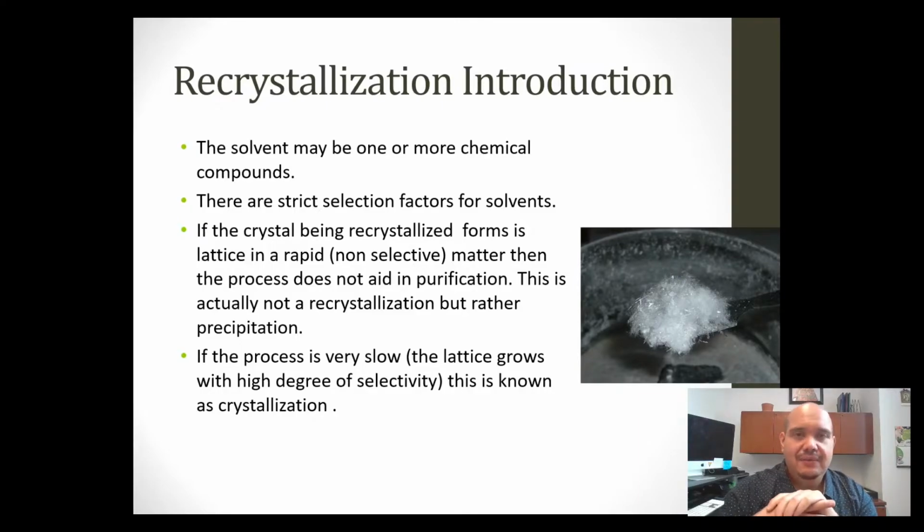So we never want to perform or facilitate a non-selective recrystallization. We never want to take a crystal and put it in a condition that's too cold, which would force it to recrystallize more quickly than it would at standard room temperature.